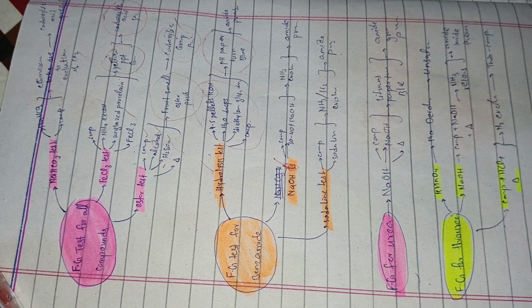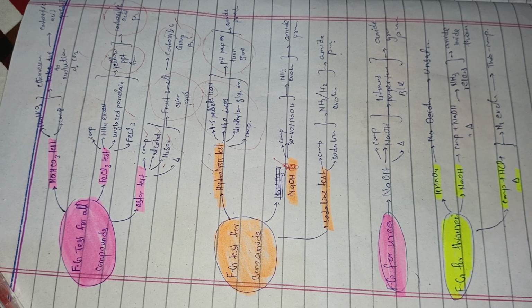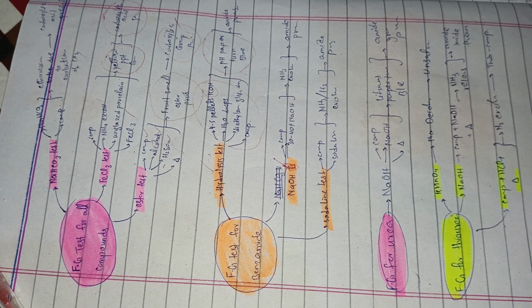Now the second thing is the NaOH test. For the NaOH test, you will take the compound and dissolve it in NaOH.